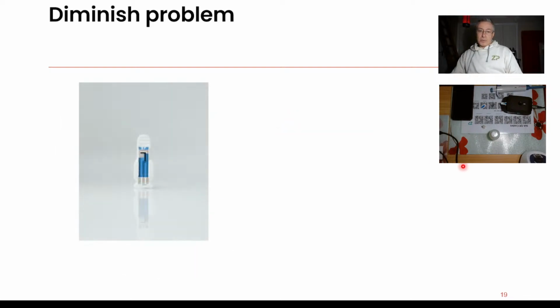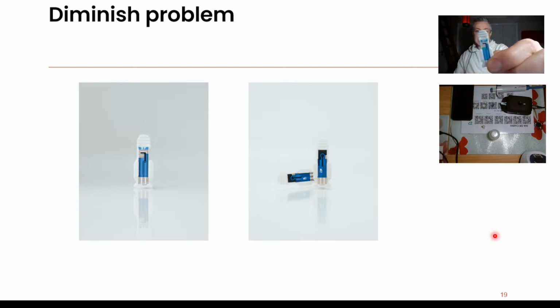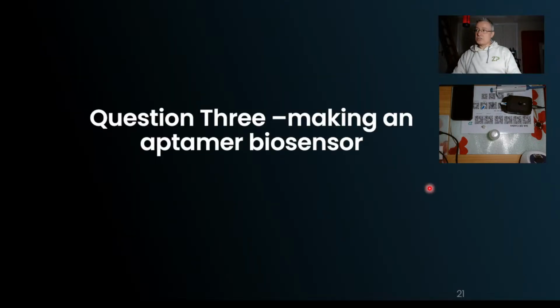But it is a diminishing problem, I would say, these days, because at least in the world of electroanalytical chemistry, a lot more people are using screen printed electrodes. All those variables that I was talking about earlier, that the potentiostat was developed to overcome, arose when people were often making their own electroanalytical cell. They have an electrode in there, it may be a carbon disc electrode, a gauze electrode as a counter electrode, and a reference electrode as well, and they would place them all themselves. Then you could have quite a lot of variability. But obviously, when you've got electrochemical cells that are printed like this, the problem is really diminishing.